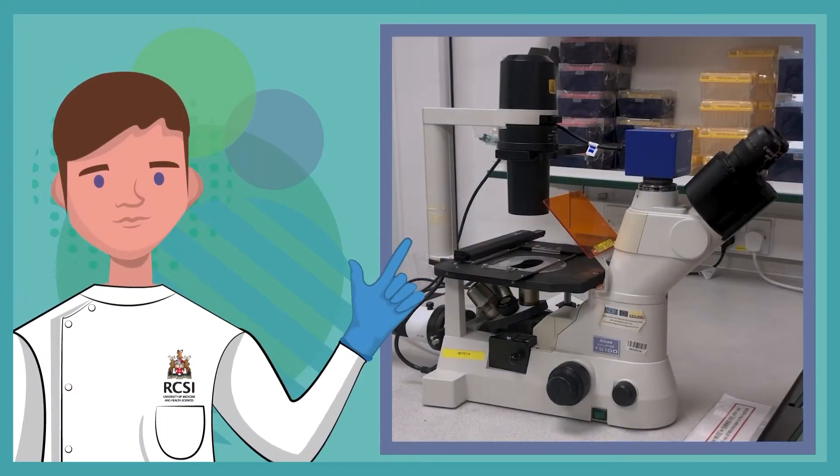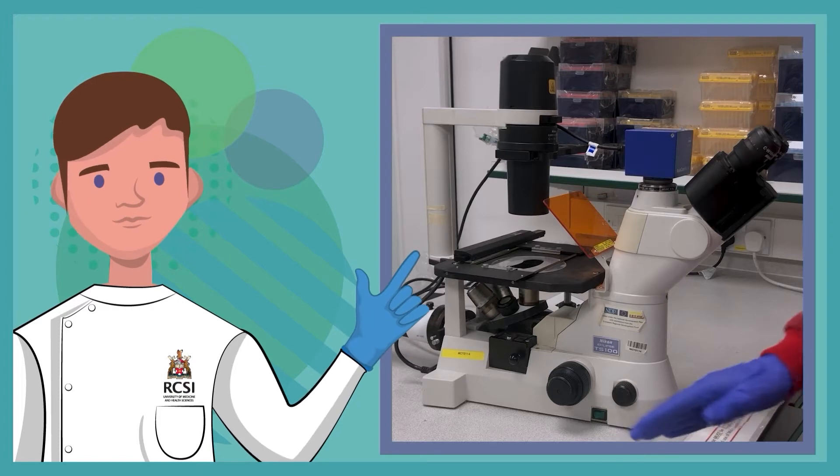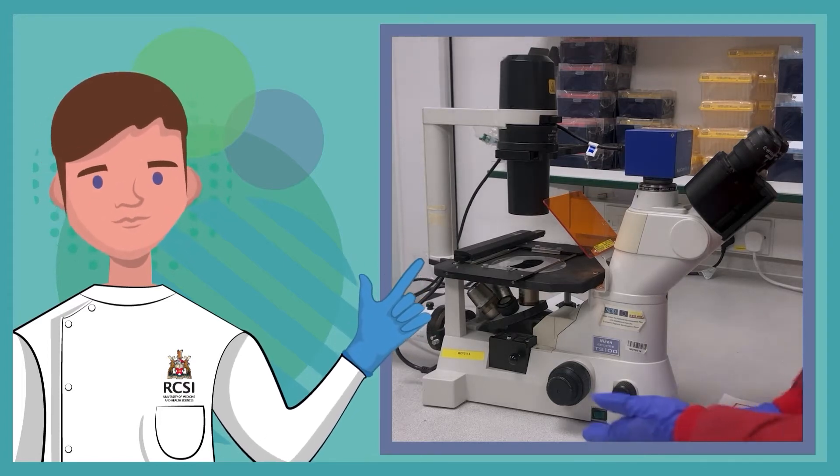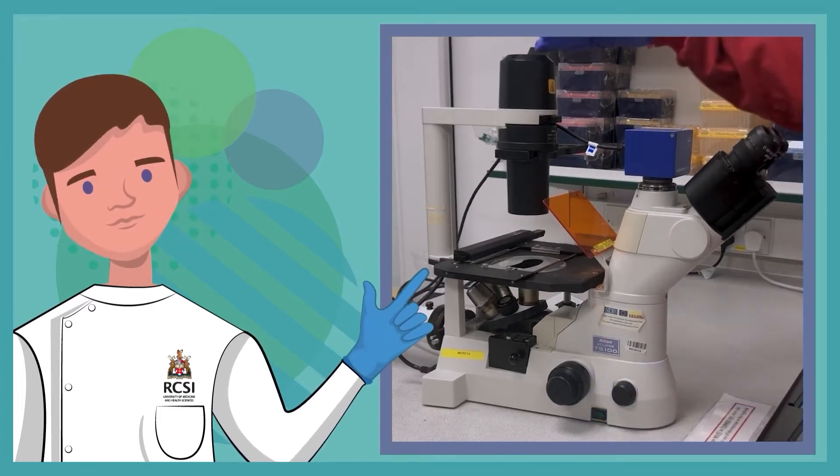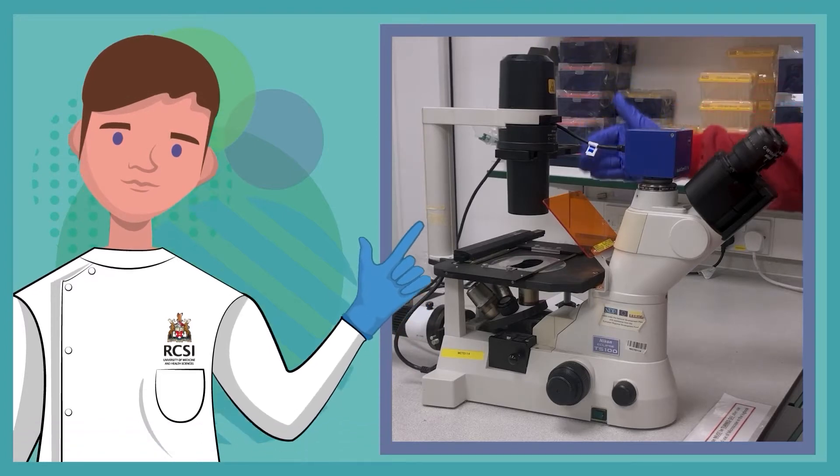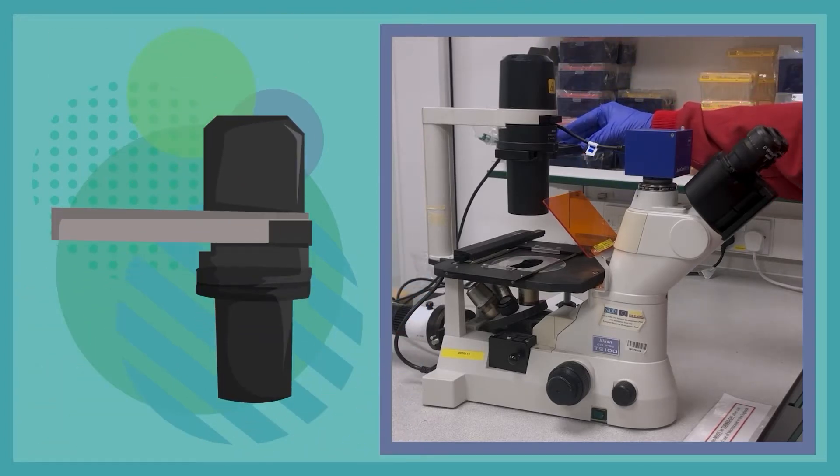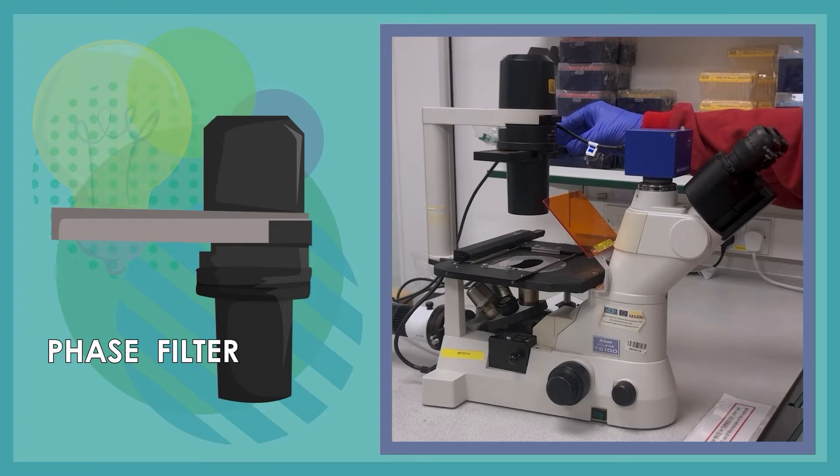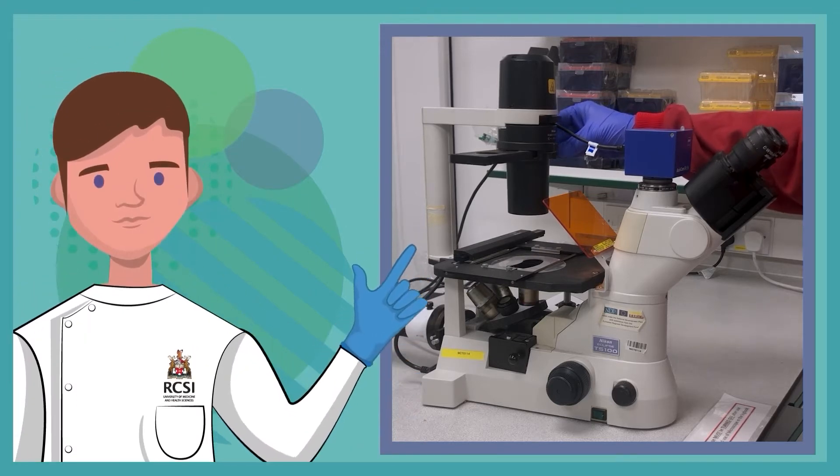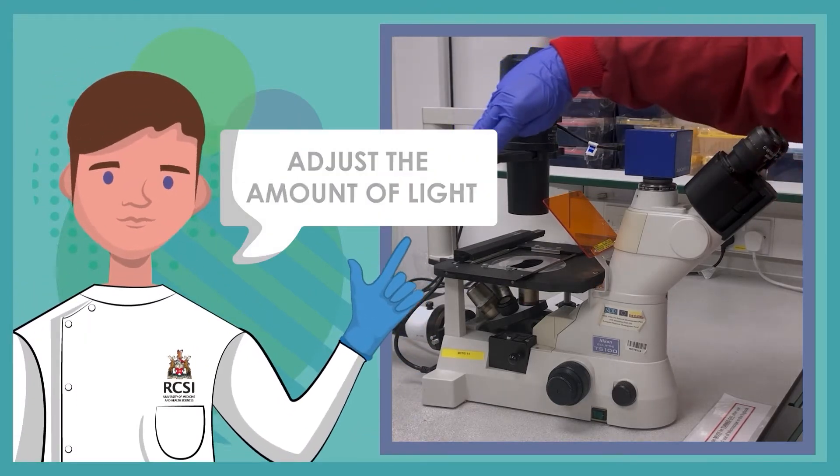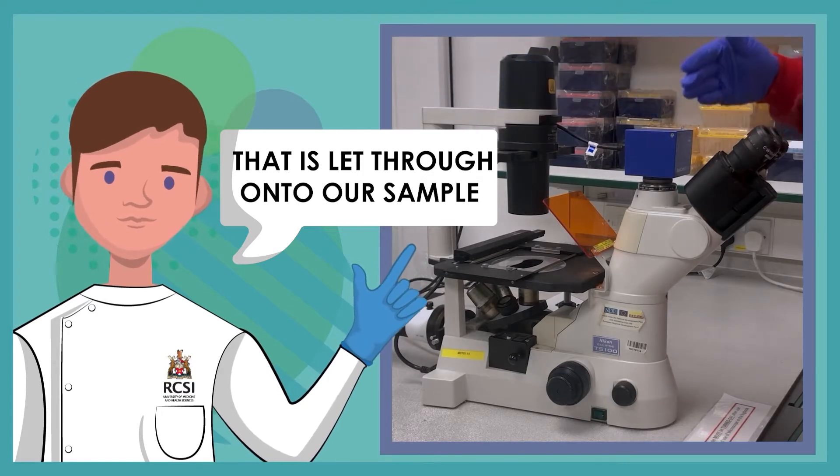So shown here is a standard tissue culture microscope equipped with a camera. There are a series of important parts to identify. Working from top down, we first have the light source which passes down through a phase filter. This filter allows us to adjust the amount of light that is let through onto our sample, adjusting the brightness.